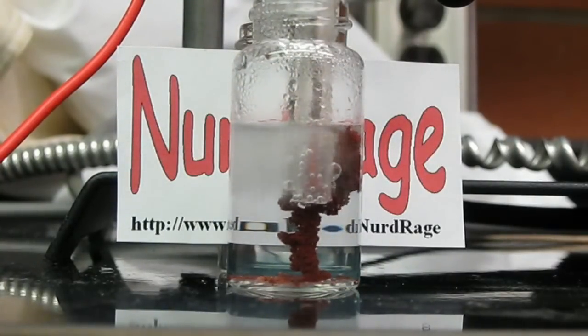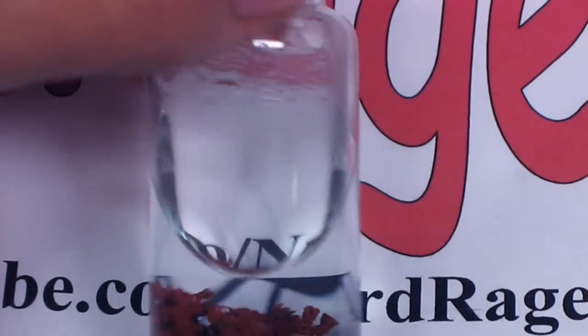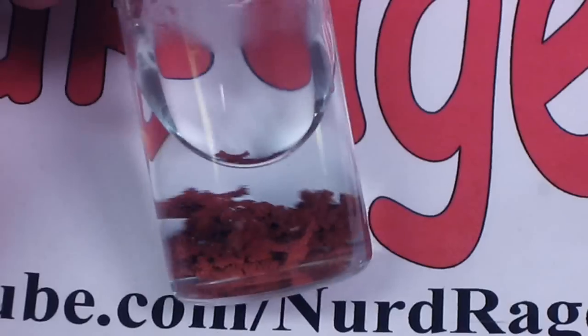Anyway, the conversion is now done. As you can see, we now have a solution of clear dilute sulfuric acid with bits of copper.